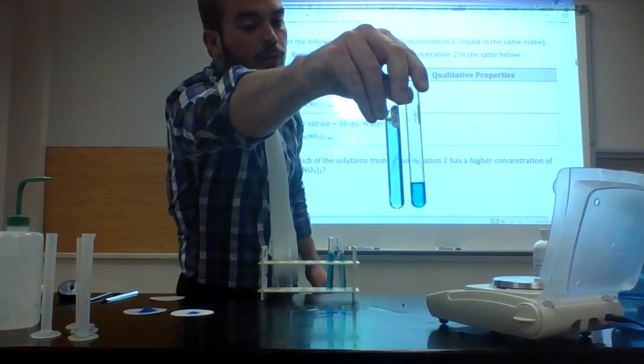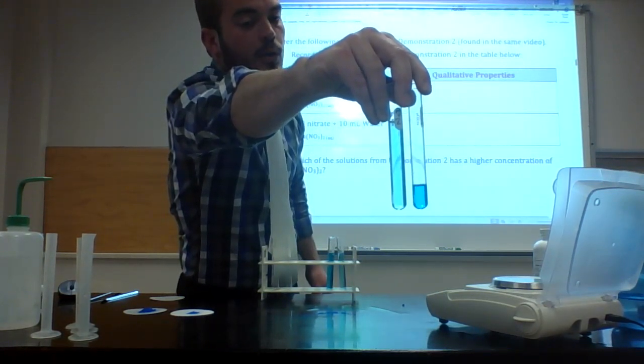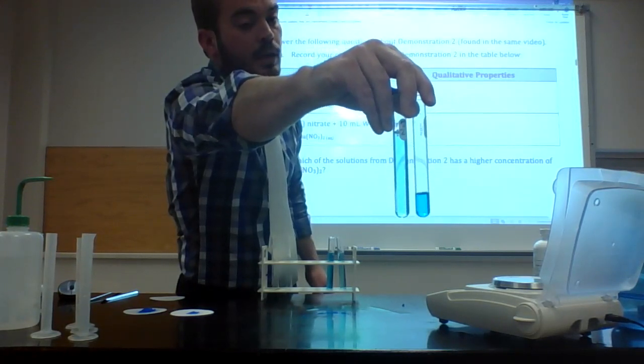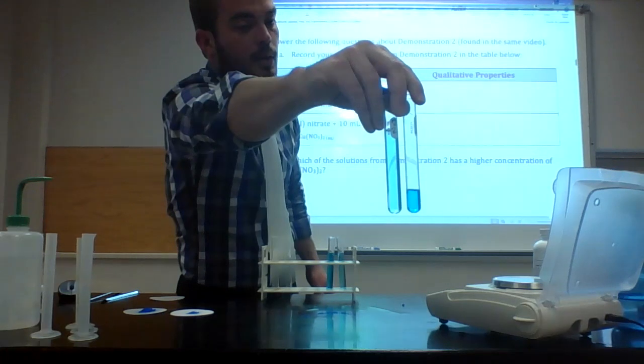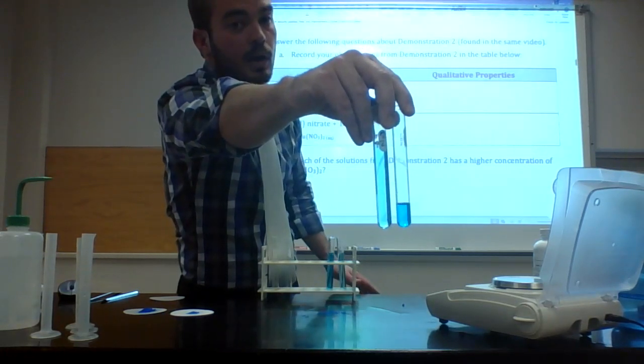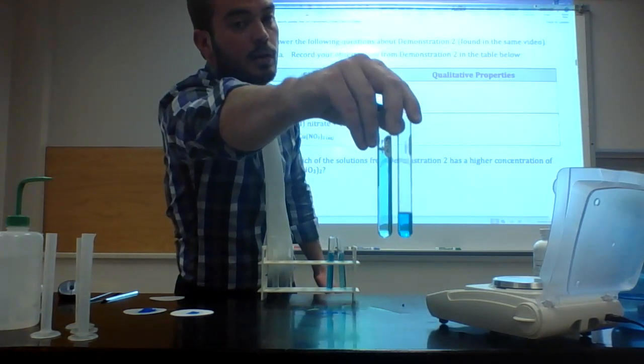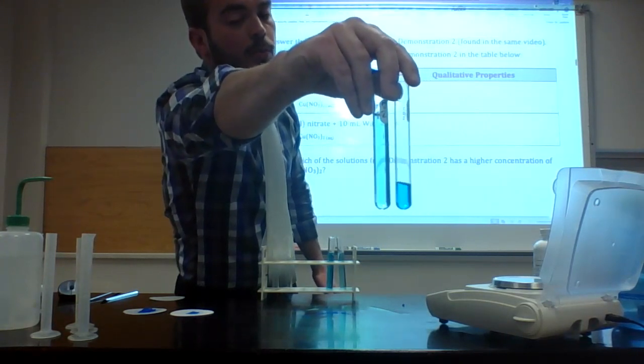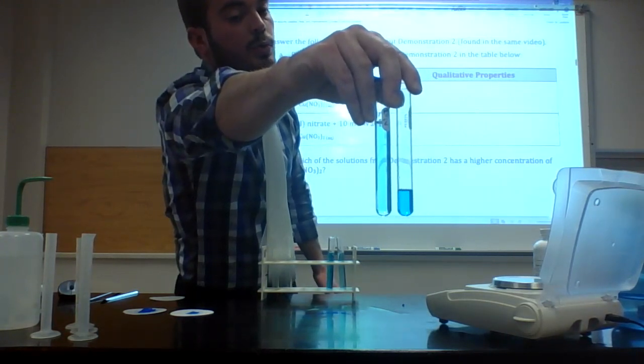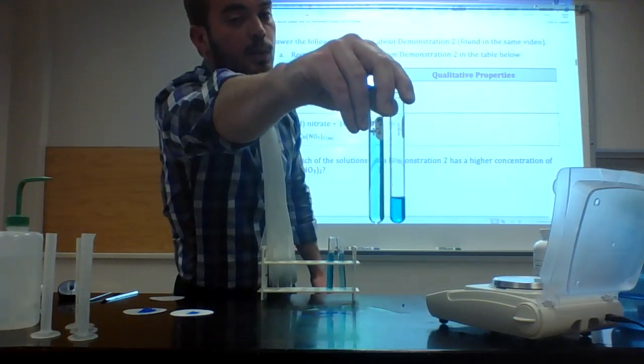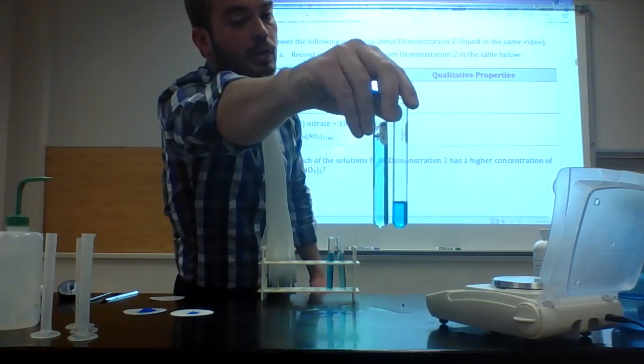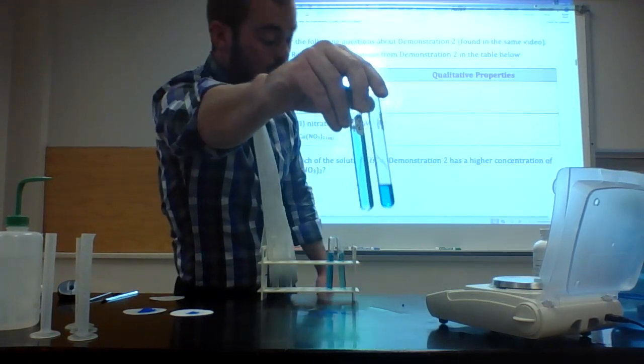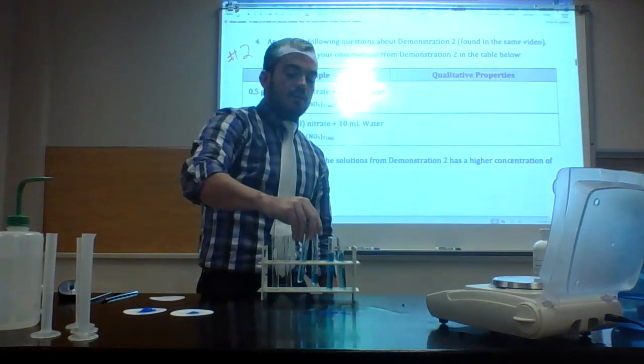Here we have our two solutions. The one on your right is 0.5 grams of copper(II) nitrate with 2.5 milliliters water. The one on your left is 0.5 grams of copper(II) nitrate, the same amount of solid, but in 10 milliliters water. Once again not super noticeable, but the solution on your right with less water is a darker shade of blue. So in this case, the one with less water has a higher concentration.